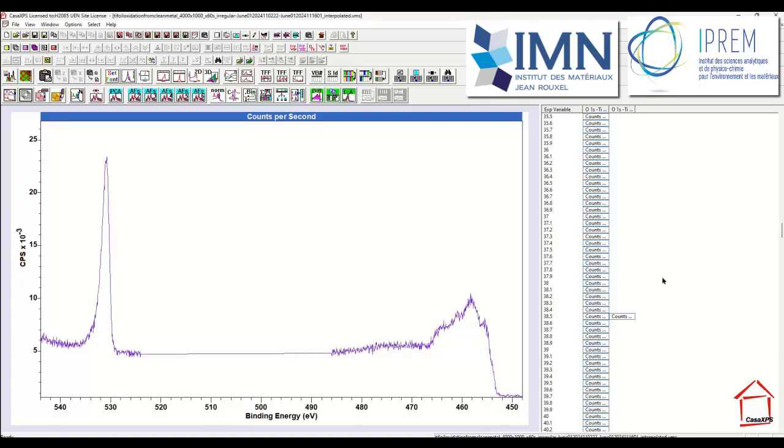And there we have something that looks plausible. The reason I believe this to be a plausible spectroscopic component is because whenever I've seen other experiments involving titanium, for example a multi-layer silicon dioxide titanium dioxide material sputtered, I've seen this type of shape appearing within the titanium. So this shape is certainly a plausible spectroscopic shape for a form of titanium that has been damaged through the use of an ion beam and is relating to an amount of oxygen. So I'm going to take another copy.